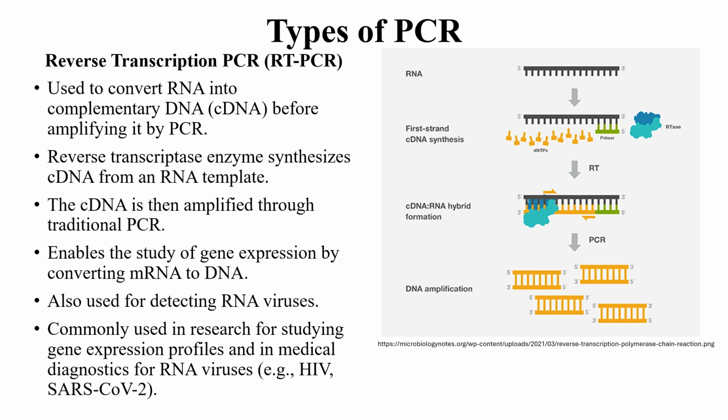The third type of PCR is a reverse transcriptase PCR. We do know some viruses have RNA as their genetic material, for example, the HIV virus or the COVID-19 virus. So when you're amplifying, you might be looking for DNA to amplify, but in that particular sample, you might not find a particular DNA for this organism. For example, in HIV, we know the genetic material is an RNA. And so when we want to amplify this RNA, what do we do?